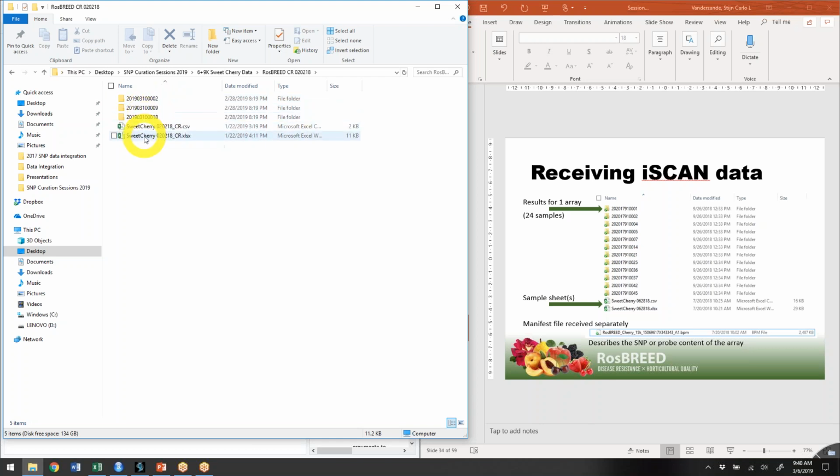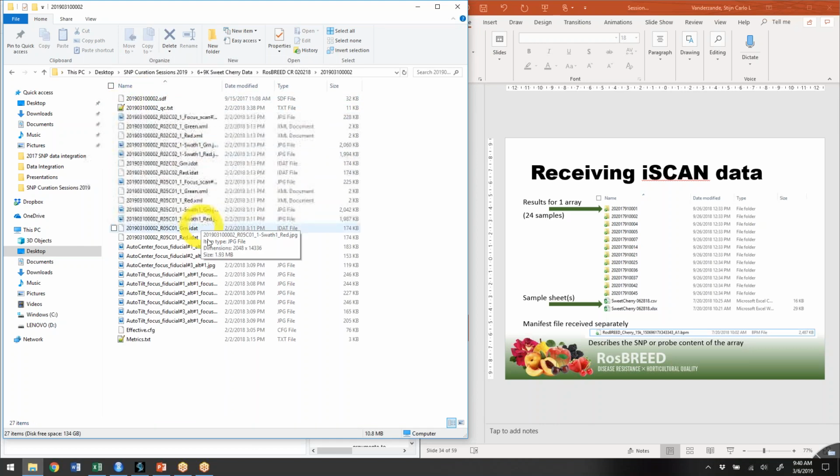And then we get another Excel file, and I'll come back to this shortly. This Excel file lists how the samples were distributed over the different arrays. You see each array has a number, and if I open this folder, as you can see, there are not a lot of individuals, because I need to make sure I only share the data of specific individuals with you.